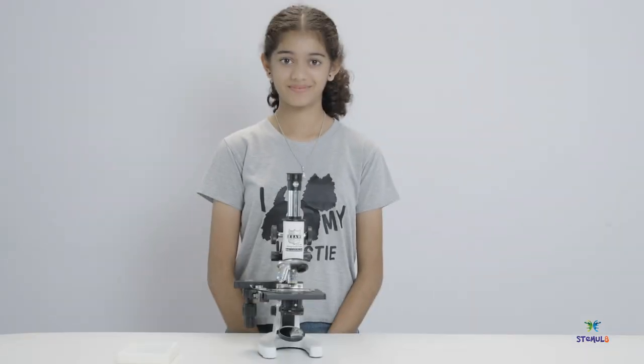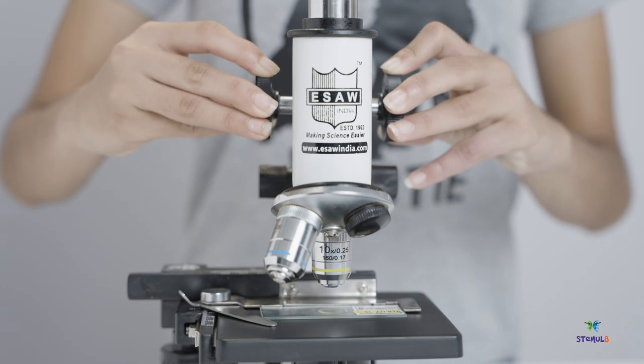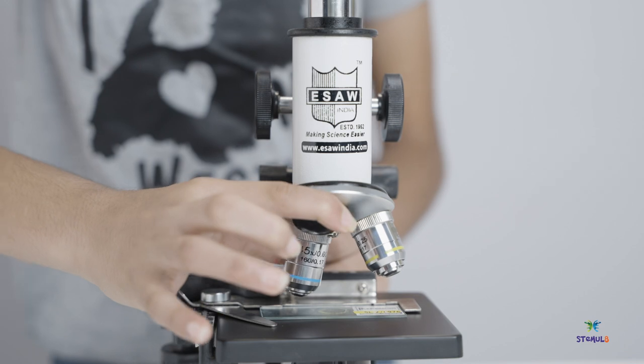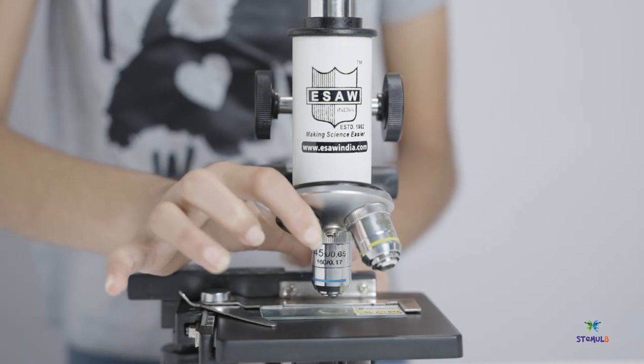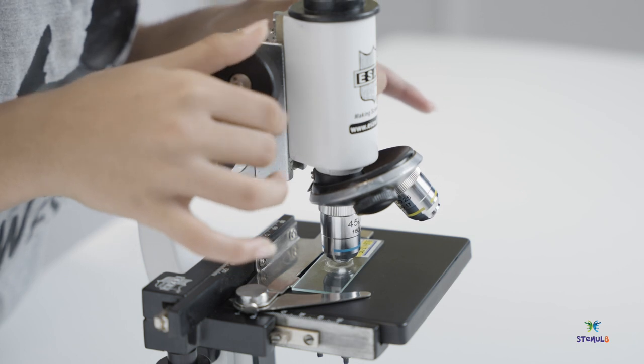You can examine your specimen now. What you have observed now is on a lower power objective. Rotate the nose piece to the next higher magnification and readjust the focus. Now you will be able to observe the specimen with a higher magnification.